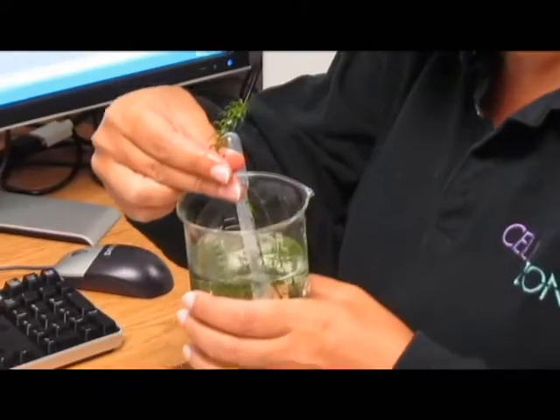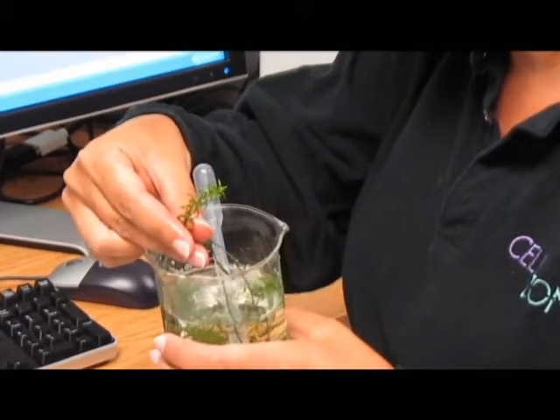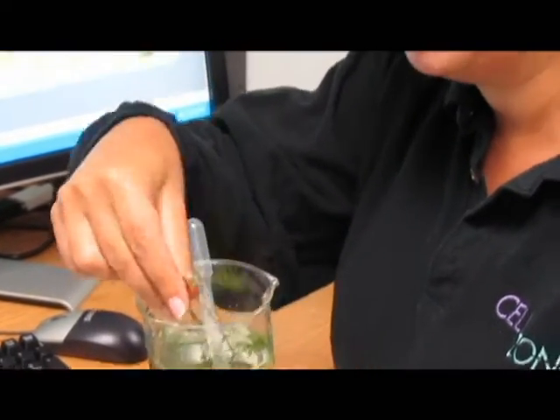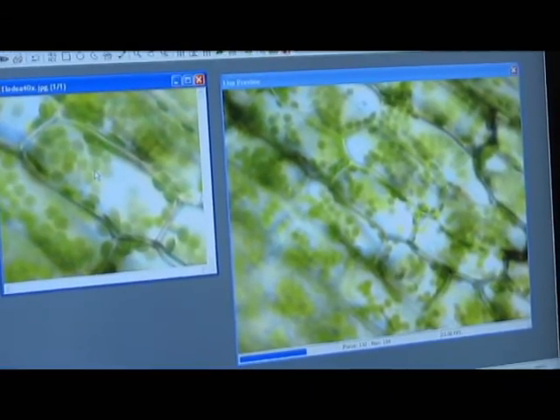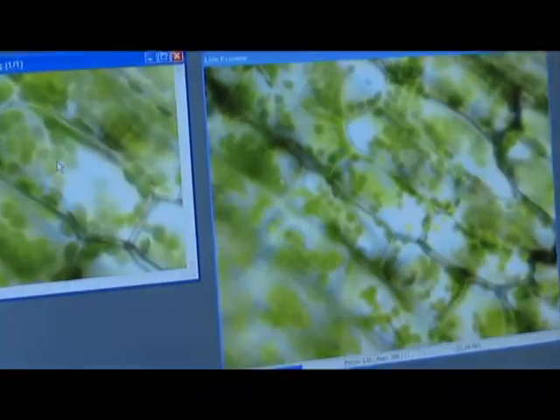Here's the Elodea plant and I've made a wet mount using one of the small leaves from this plant. I put the wet mount on the microscope — this scope is equipped with a digital camera so we can view a live image of this particular Elodea leaf.